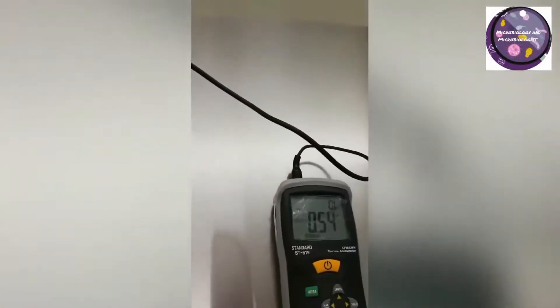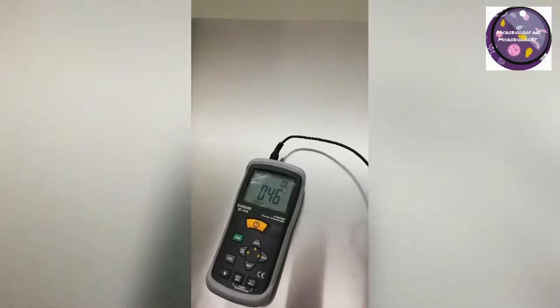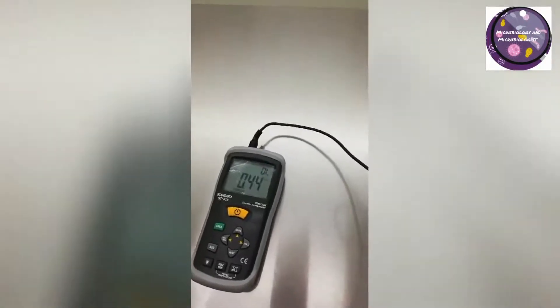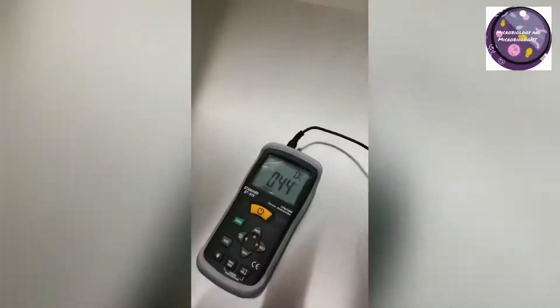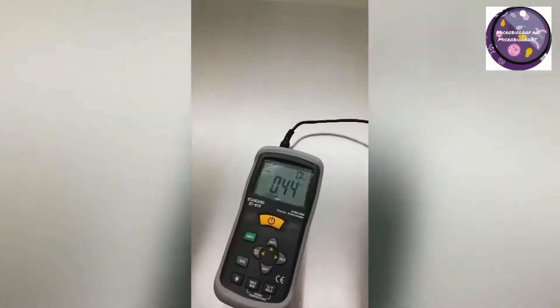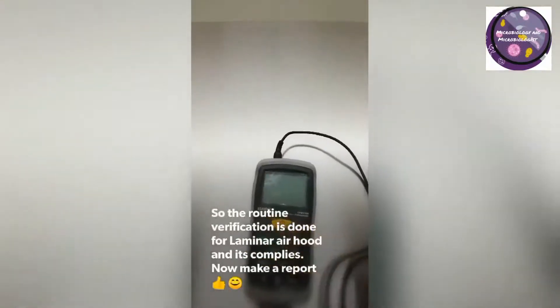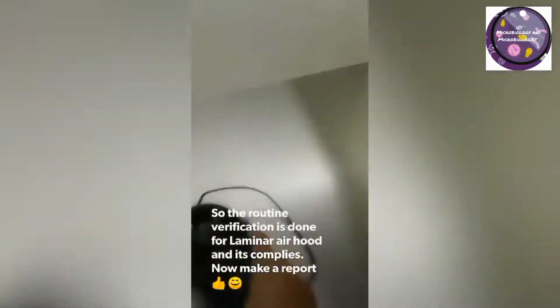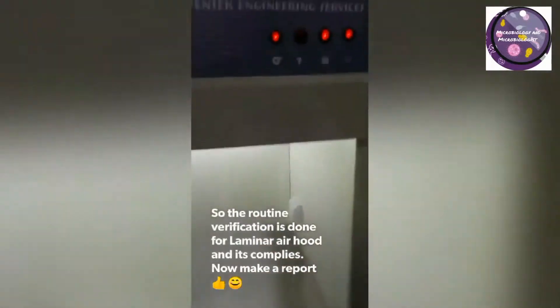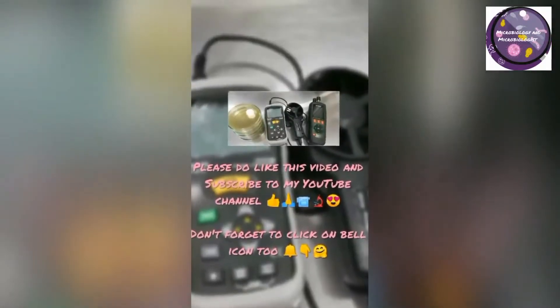If the result is not within the limit, we will submit the report to the engineering department. The routine verification of the laminar airflow hood is now done and it is ready to be used. I will make a final report and submit it to the manager so he knows the laminar airflow hood is compliant for microbial testing.